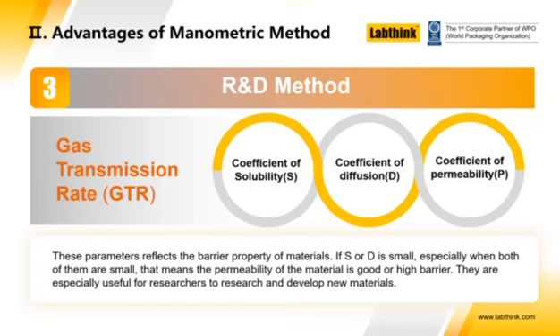One of those studies involves the measurement of a specified material under specified conditions for oxygen transmission rate. Some of the equipment that participates in those studies is some of the manometric Labthink instruments, and so those results can be independently compared to the results obtained by following the coulometric D3985 method.